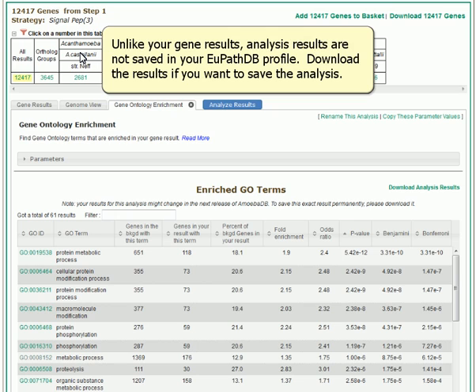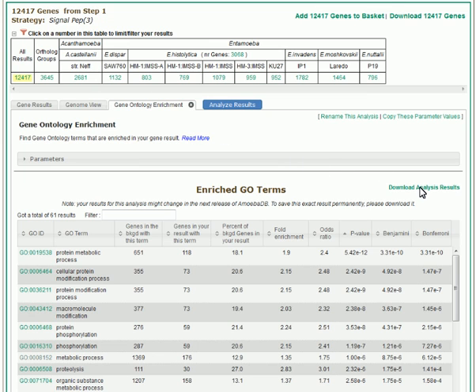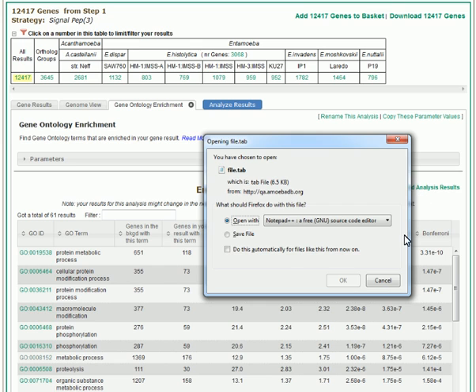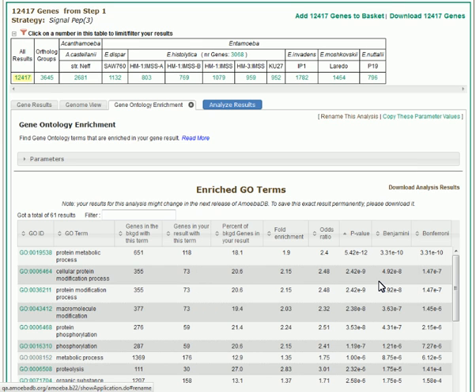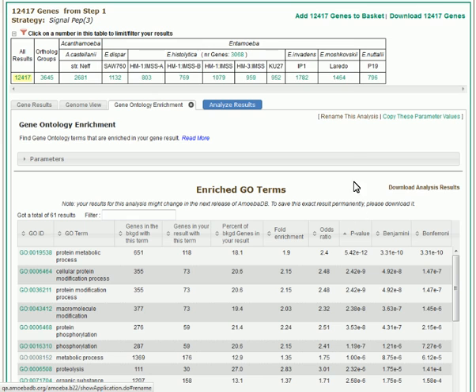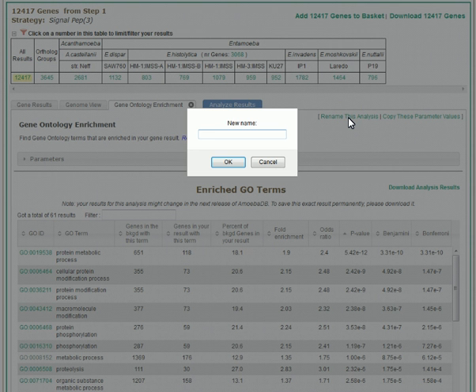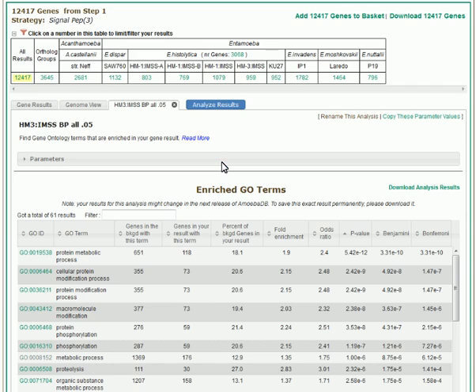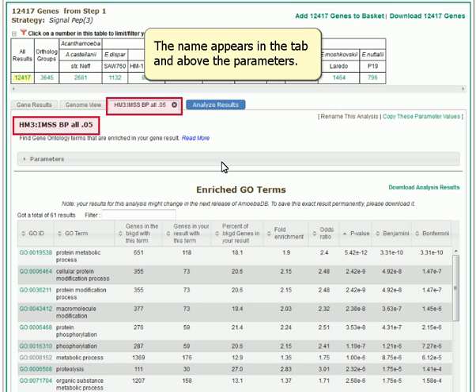Unlike your gene results, analysis results are not saved in your UPathDB profile. Download the results if you want to save the analysis. You have the option to name the analysis. The name appears in the tab and above the parameters.